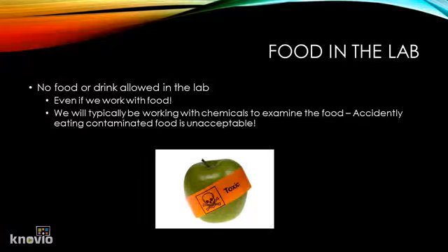So sometimes in biology, it can be common that students work with foods in the lab to examine them for different properties or macromolecules. So food and drink for students should not be allowed in lab. Water bottles should not be allowed in lab. Snacks and gum should not be allowed in lab because those are easy ways to accidentally ingest chemicals if they contaminate your food source.